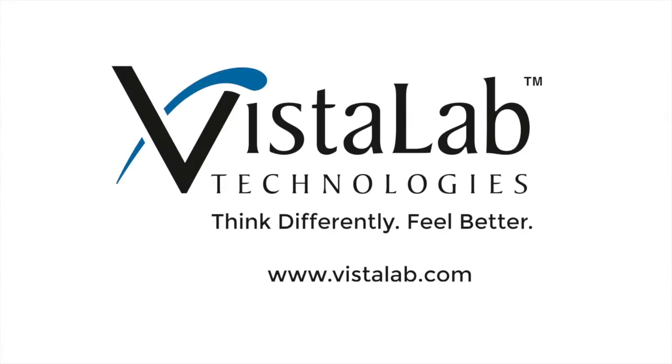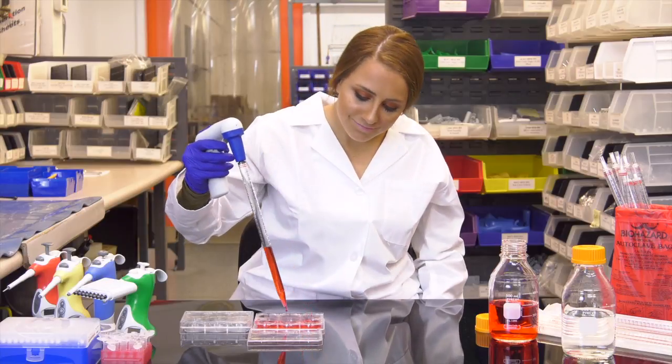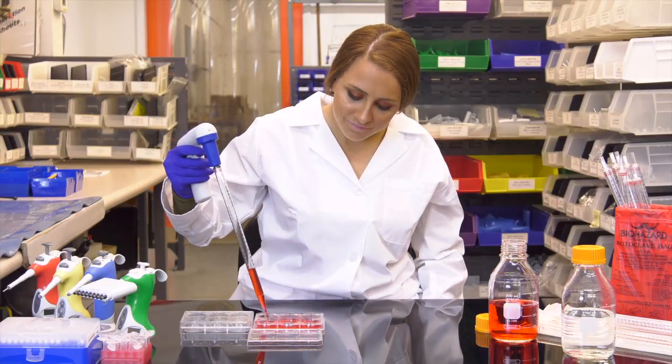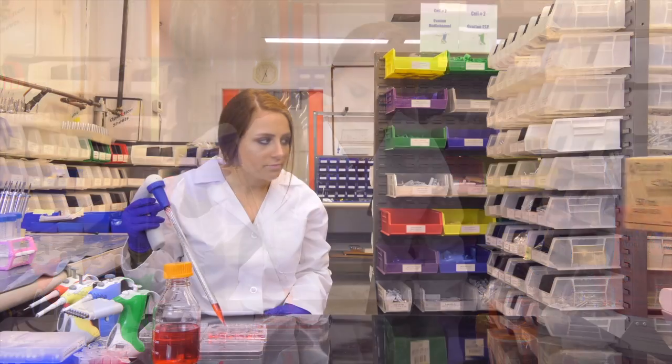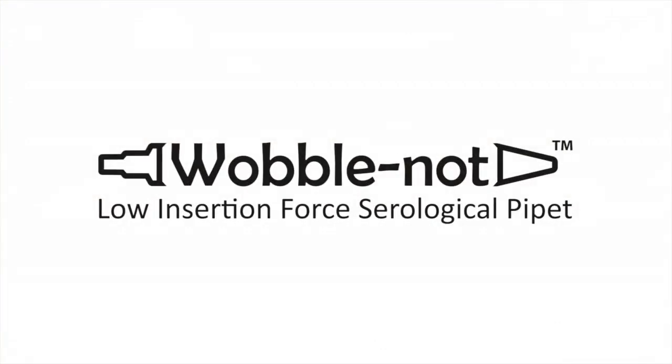Your work will go more smoothly, more quickly, saving time and reagents. So optimize your efficiency, accuracy and productivity with Wobblenot by Vistalab — designing products for your health so you can focus on the science. The better way to pipette.